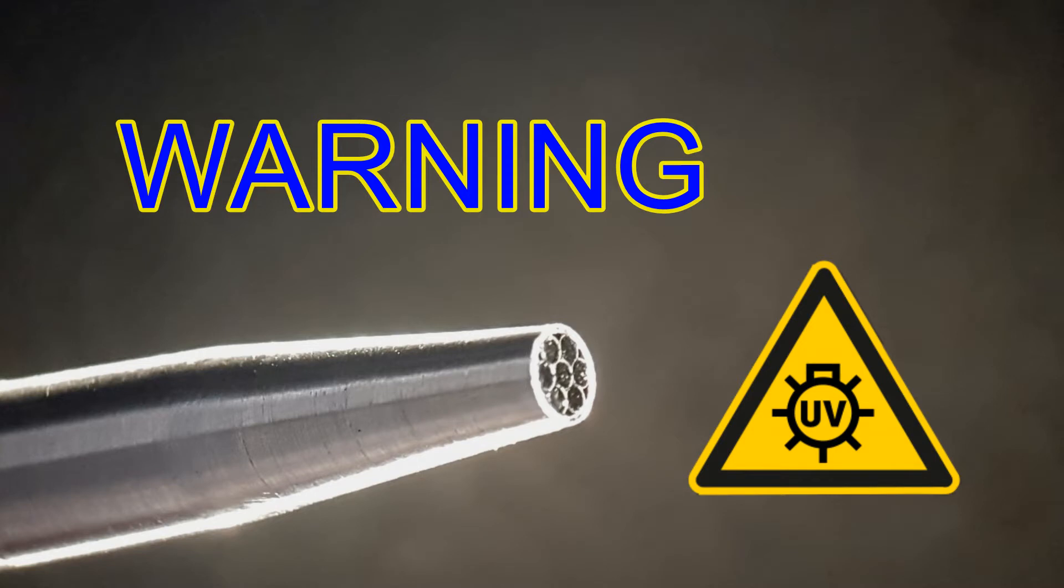Never, never look directly into the probe end. It is advised to use the supplied polycarbonate safety goggles to protect your eyes during prolonged use of the instrument.